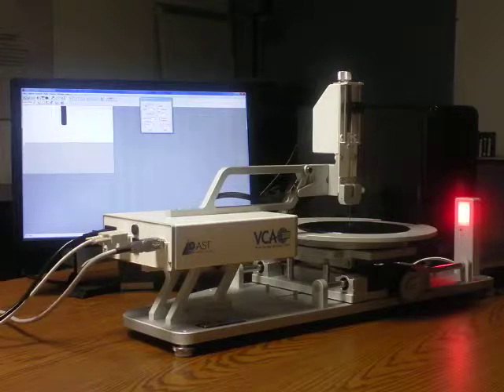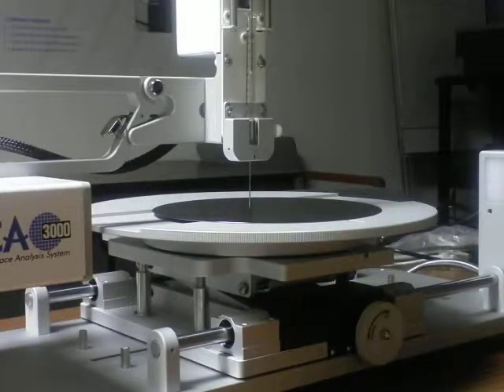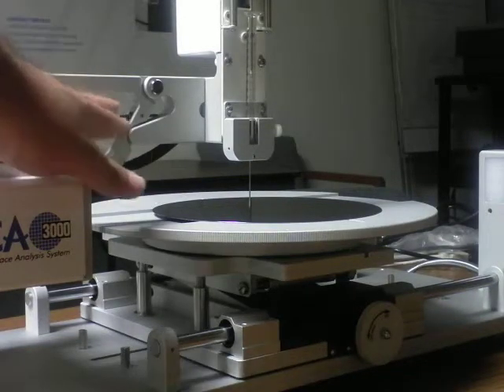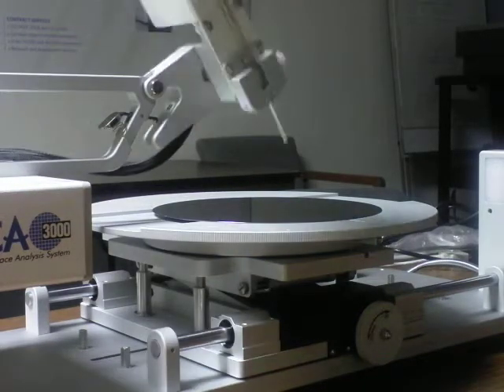We're going to take a closer look at the hardware itself now. This is the stage for the VCA 3000S. As you can see, I have a wafer on the top of the stage at this point. You can move the automatic syringe away from the stage in order to place your wafer down on top of it.